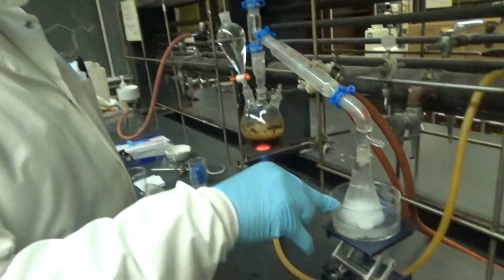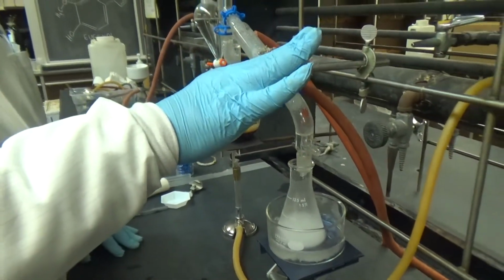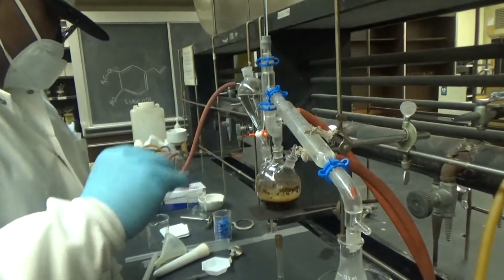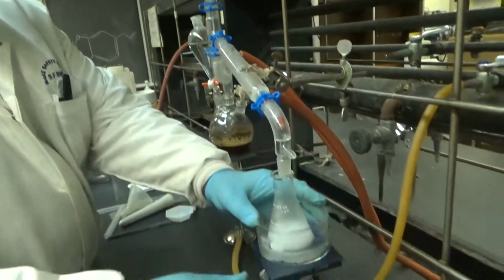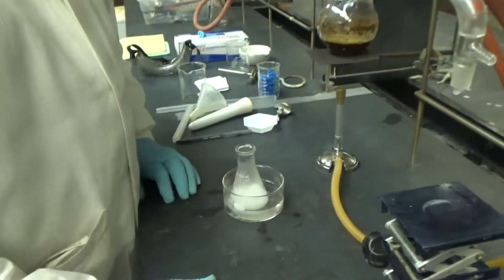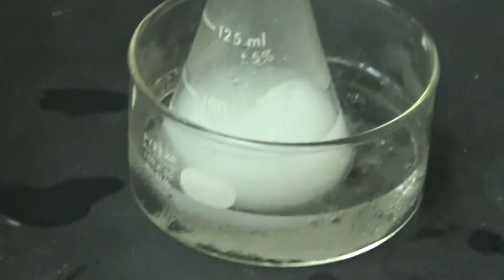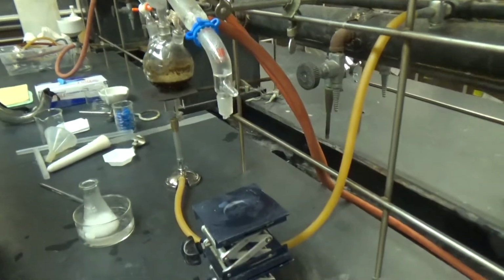Okay, now we did collect 75 milliliters of co-distillate. That was your target, right? There it is, 75. The first thing you do is turn off the gas. You leave the water on, it has to cool down before doing anything else, and the big flask has to cool down too. But turn off the gas first. Right, so there's your product, and I will take that here. It's a kind of milky white solution. Still dripping a little bit, but that's okay.